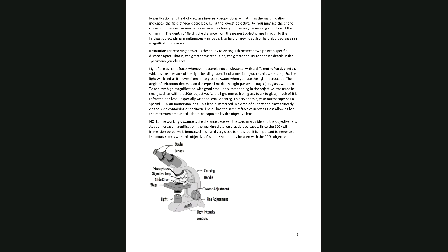So you use the coarse focus when you're on the low magnifications because the coarse focus moves the stage a lot. You use the fine focus when you get up to high dry and oil because the fine focus just moves the stage a little bit. If you're on high dry or oil and you grab the coarse focus, you only have about 1 millimeter of working distance. So you turn that too far and you're going to break the slide. And if you were very unlucky, you would break the lens, which is very expensive to replace.